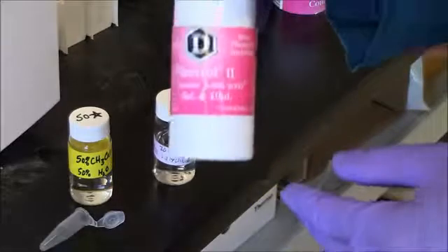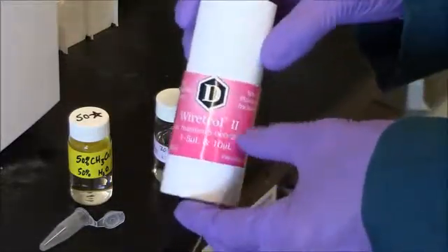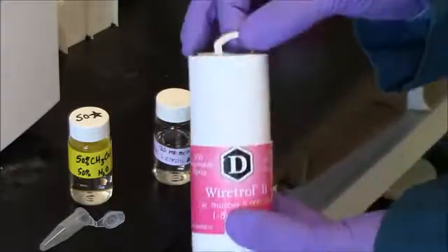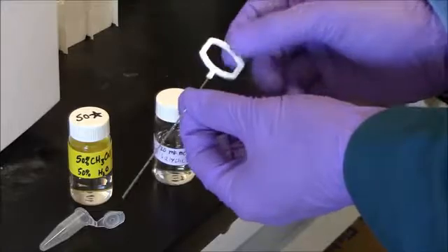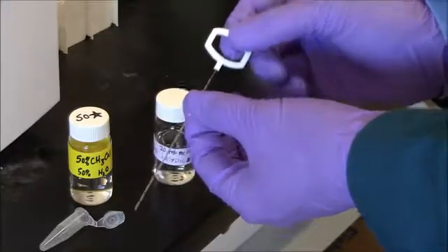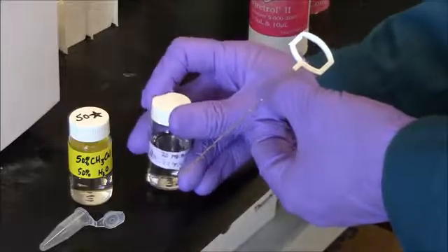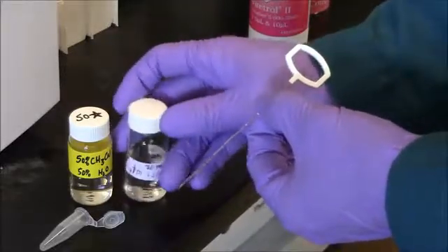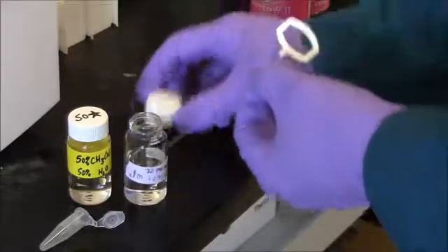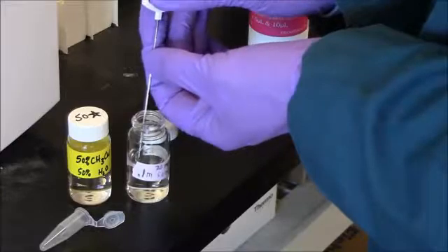I'm using a microcapillary that actually measures well from a box like this. It comes with a plunger. When it's assembled, it looks like this, and I can pull the plunger up, and there are lines here that mark the microliters. So I'll get 4 microliters, and I'll dilute it to 200. That's a 50-fold dilution. In this case, it's not critical. I get a precise amount.